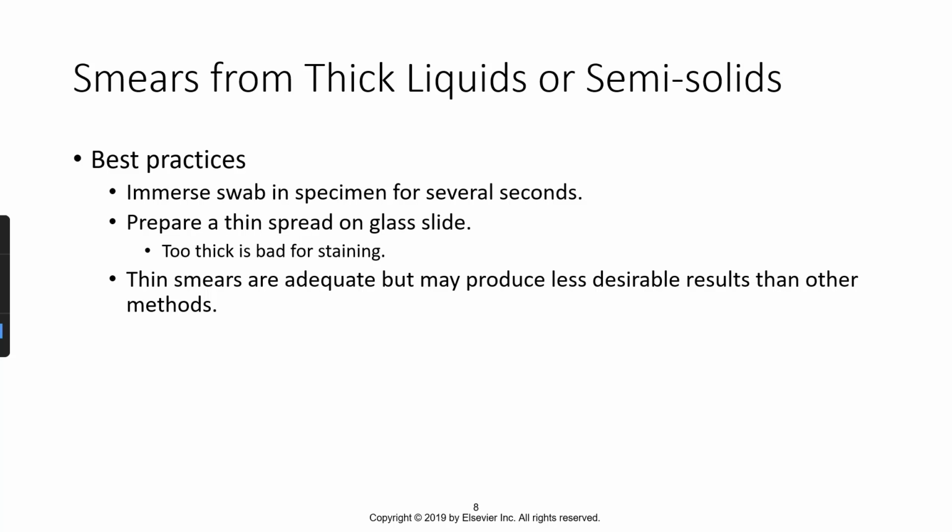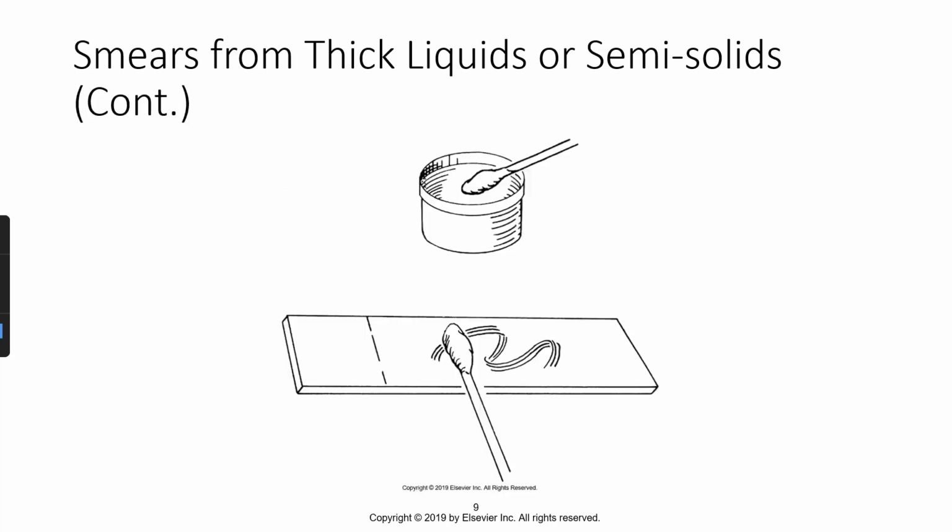Thin smears are adequate but may produce less desirable results than other methods. If you have super thin, you might not be able to see what you're looking for. So here shows how to smear from thick liquids or semi-solids.